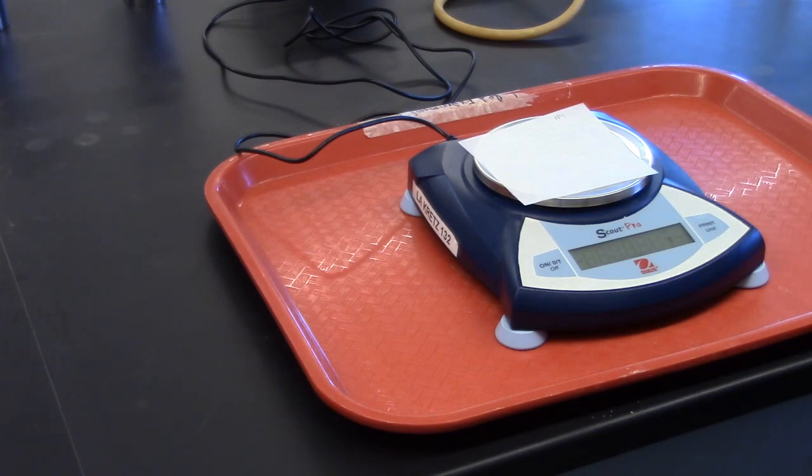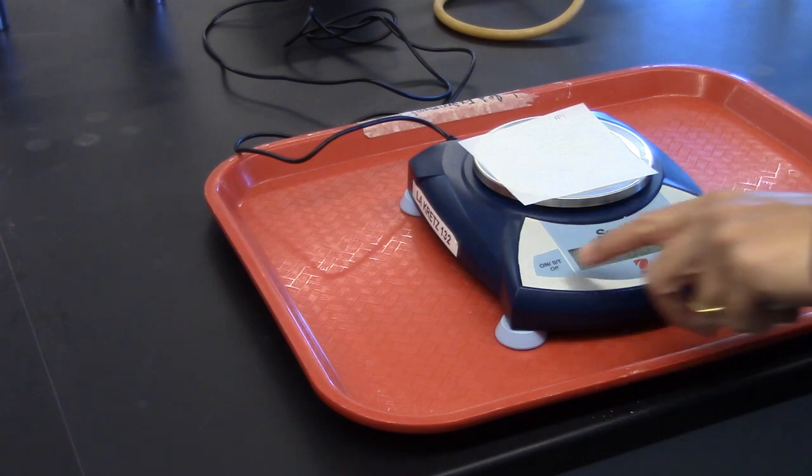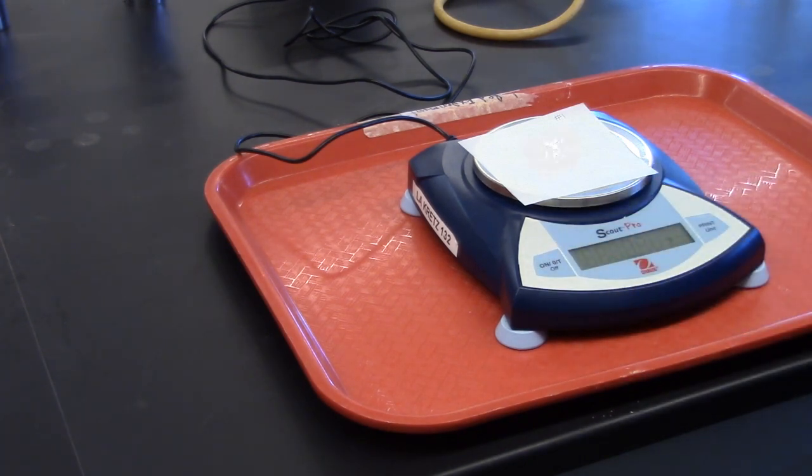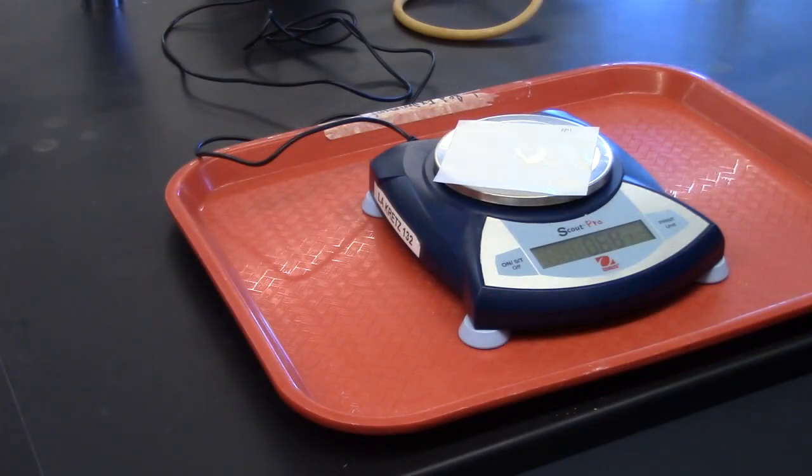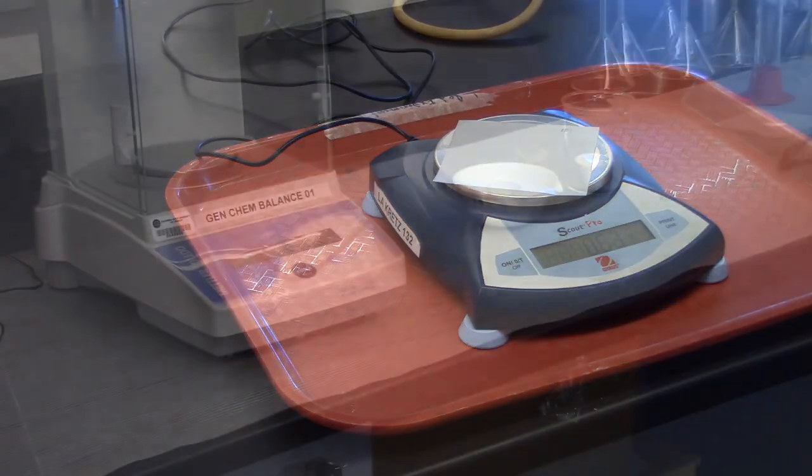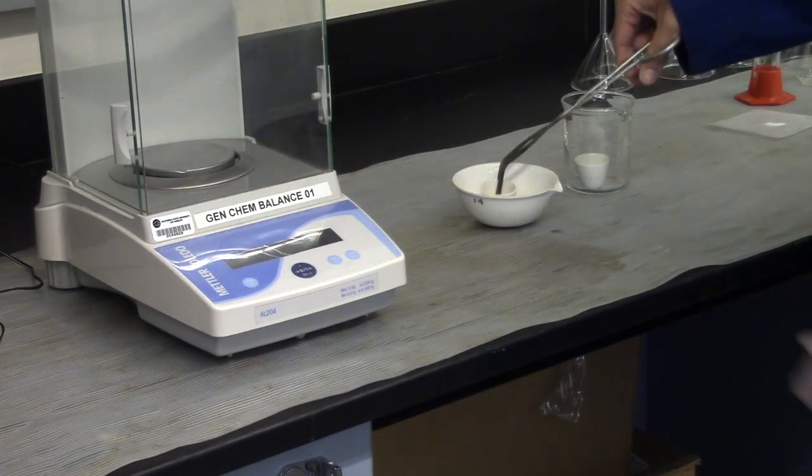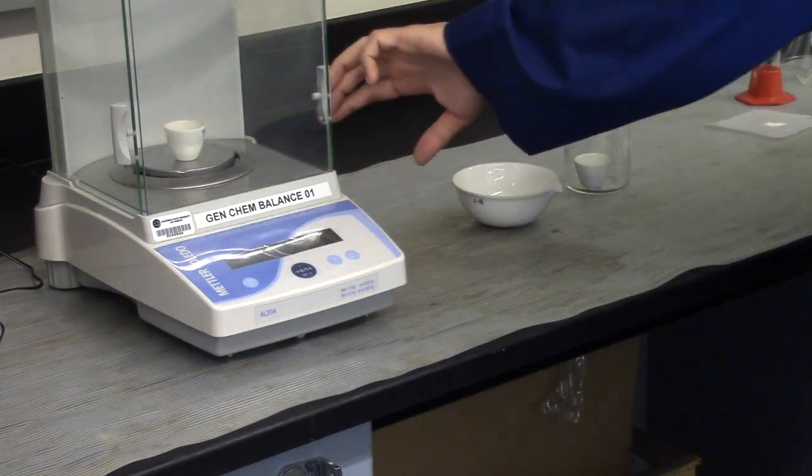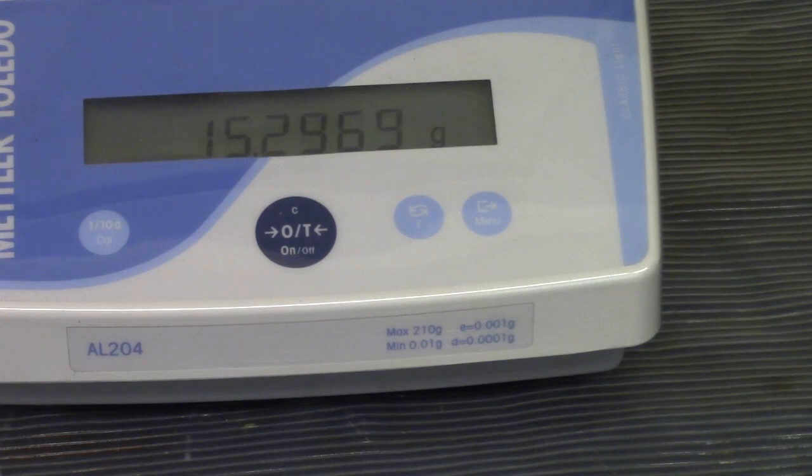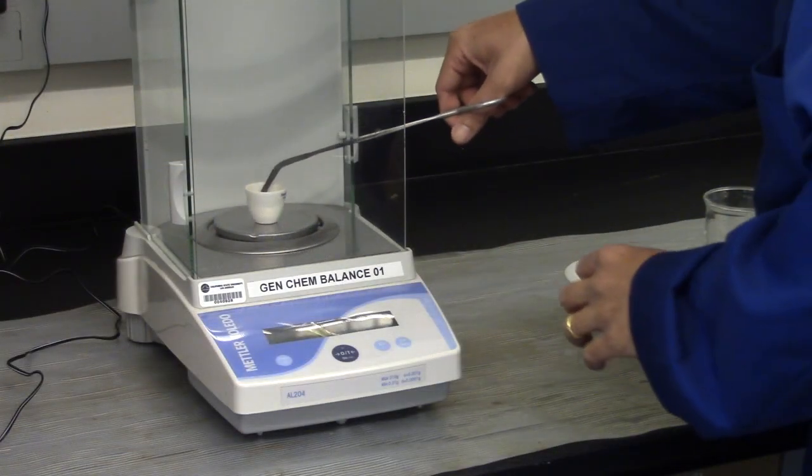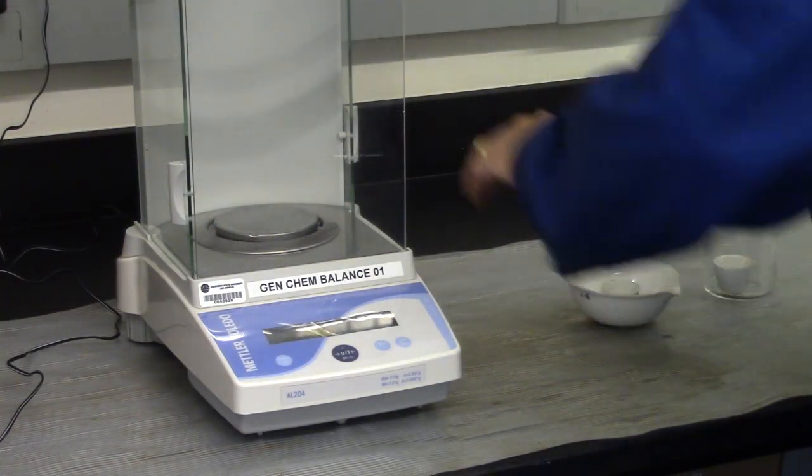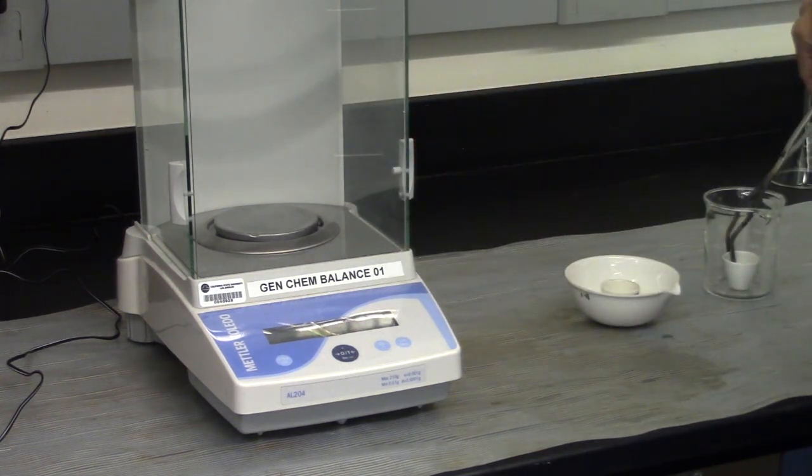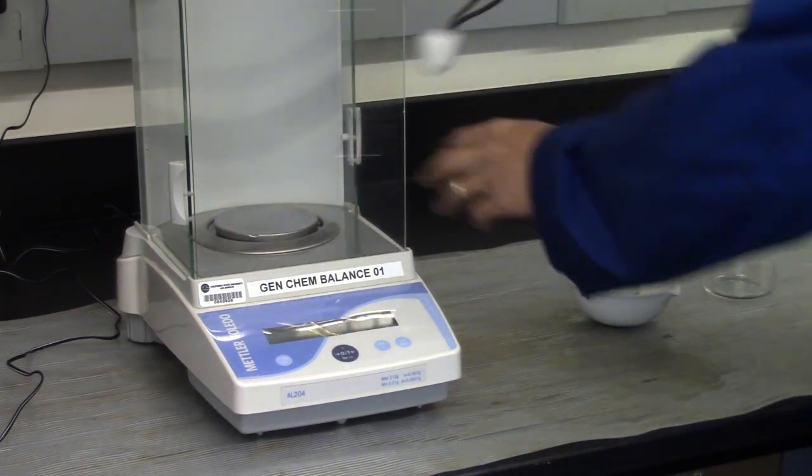While the crucible is cooling, weigh the weighing papers on the centigram balance. Use the tare function. Weigh approximately 0.6 grams of the synthesized sodium hydrogen carbonate and 0.6 grams of the commercial baking soda. You will weigh the crucibles after they cool. Make sure you have a way to tell them apart, such as different containers to transport them. Weigh them empty. Record the mass of the empty crucibles and the analytical balance used. Use an evaporating dish to carry the crucibles back and forth.